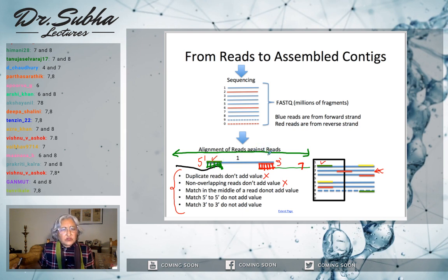Once you do that, you take this contig and search everything else. Then you go iteratively like that until the contig can be made bigger and bigger. Once it's no longer able to get bigger, you stop. So you're getting a hang of it, right? That's how you do read by read assembly. That's what we did for Sanger sequencing. These are the methods we used for Sanger sequencing. Nothing fancier than what we're doing here.